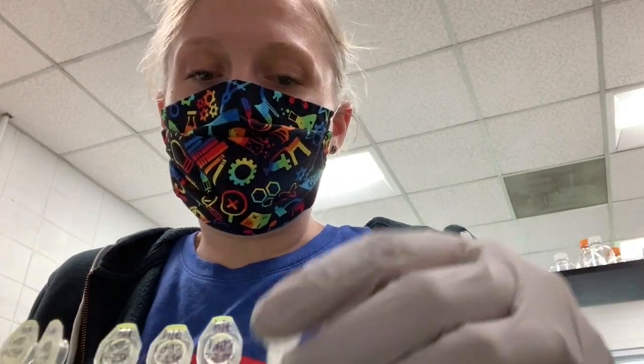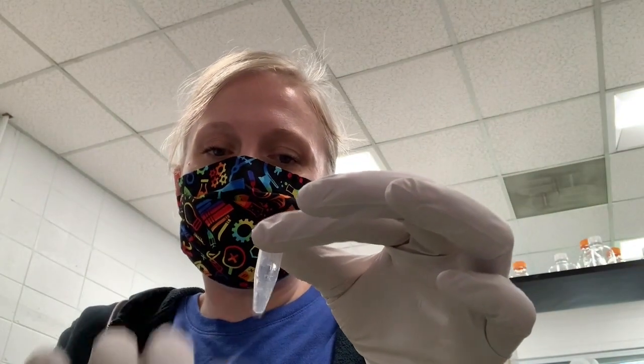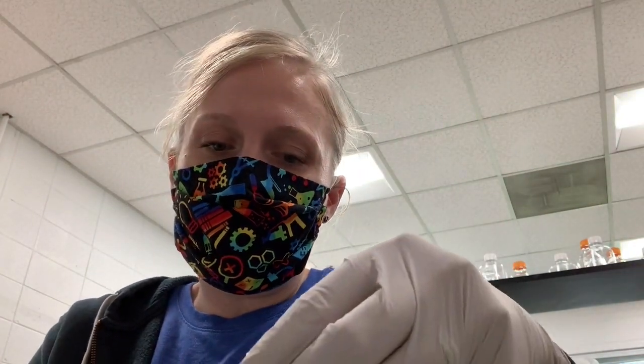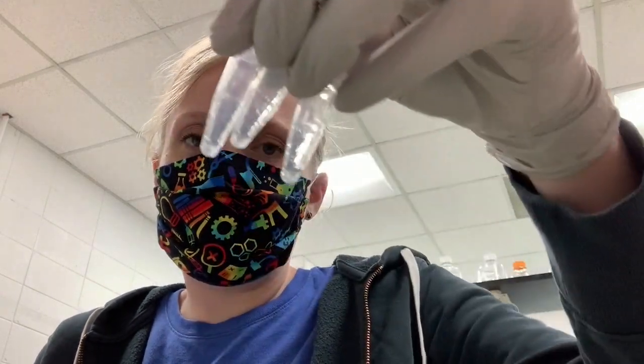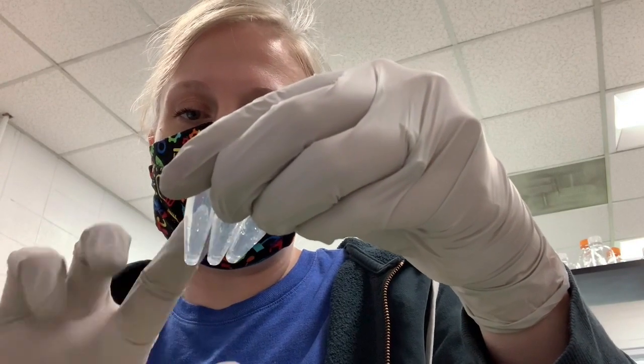Okay, so I have my tubes in the rack. I've added the water. I'm going to cap the tubes. And at this point, the pellet should be a little bit whitish or opaque. And you want to flick the tubes until the pellets become dislodged and sort of up in the liquid. And it will take a moment or two for the double-stranded RNA to resuspend. So what you can do is just set a timer for 5 minutes and then come back. If you still see one of those pellets that hasn't fully dissolved, you might give it a few more flicks. That's what I'm doing to just dislodge the pellets from the bottom. Start my timer. Give them 5 minutes or so, and then we'll be ready for annealing.